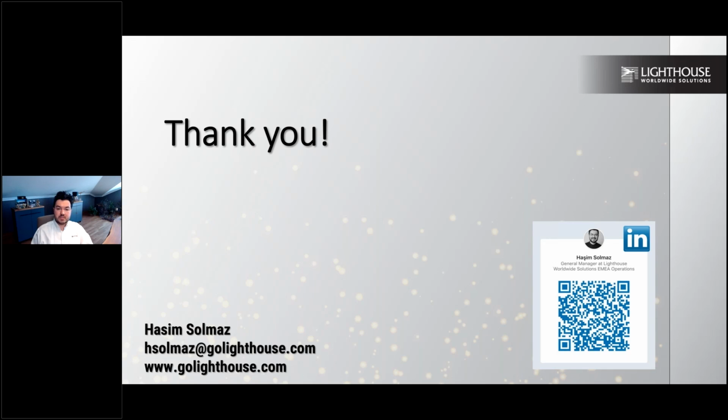One other question was about cleanroom monitoring for viable and non-viable. This question is about the viable: how many locations you're going to sample for viable monitoring. Especially for viable monitoring systems, these locations are to be defined like we do for particle monitoring systems.